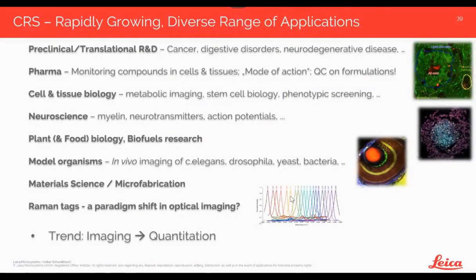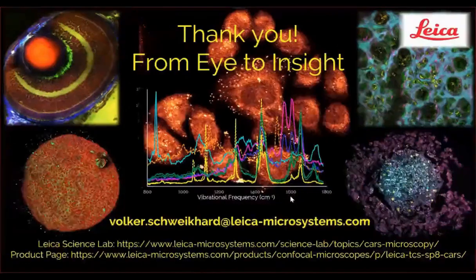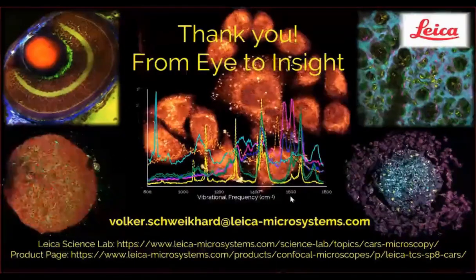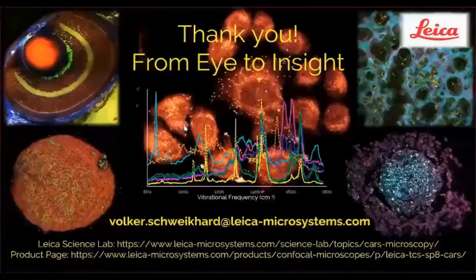And overall, what I think the vibrational imaging approach really lends itself to is a quantitative approach, where we're going from purely qualitative imaging information to a more quantitative way of looking at data that is, for example, enabled by such ratiometric analyses of spectral features, as I have shown in several places in this presentation. So with that, I would like to thank you for your attention, and I'm happy to take your questions.